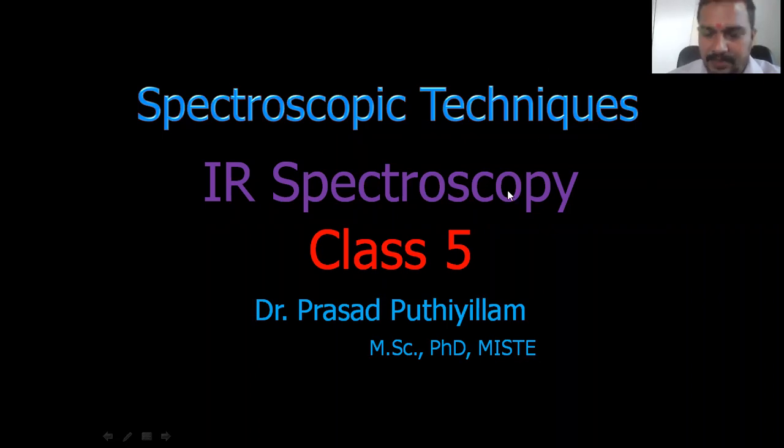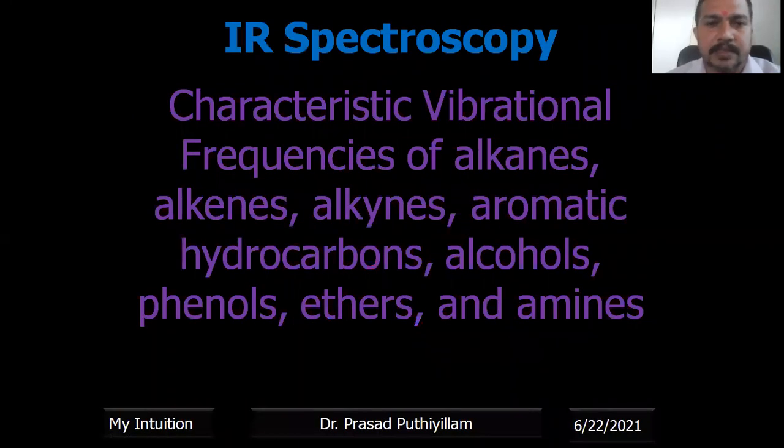So in previous classes, I explained the basics of IR spectroscopy, including the different types of vibrations of molecules, of organic molecules mainly, which absorb the IR spectrum and give a corresponding peak in a percentage transmittance versus wave number plot.